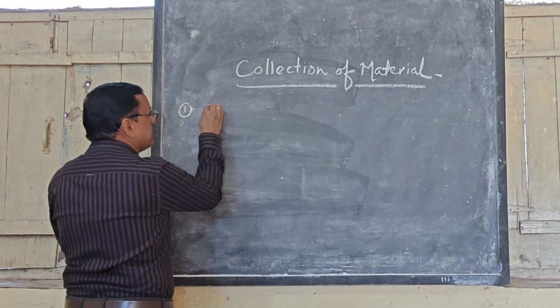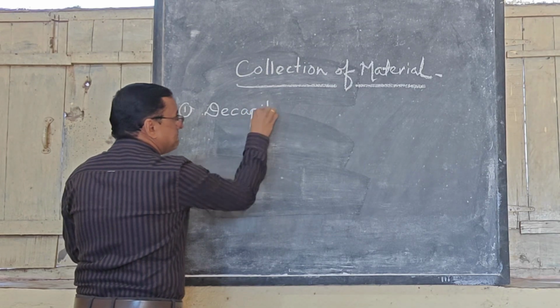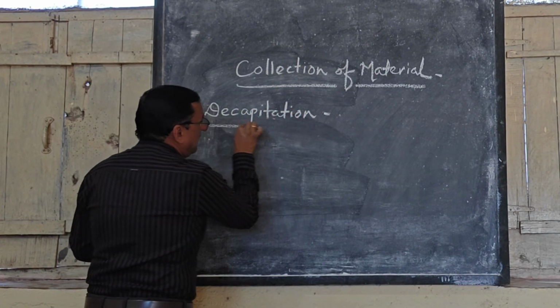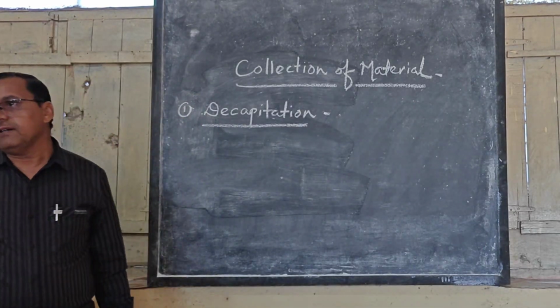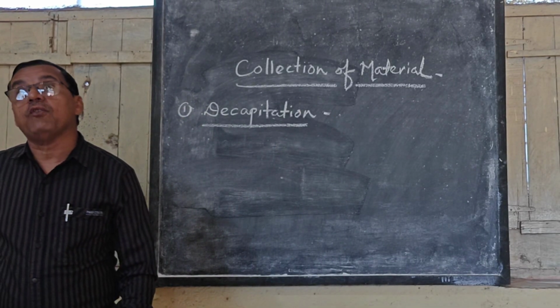The first method is decapitation. Decapitation means removal of head or cutting of head.